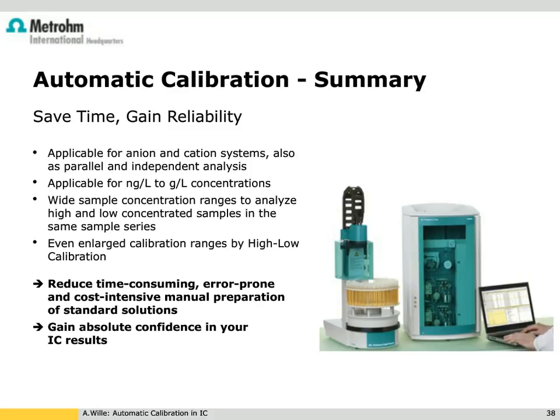Great. And then I've got one from Laura. Can you comment, Liz, on practical suggestions for improving the signal-to-noise ratio? Well, I guess going on from the noisy baseline, the first thing is probably check your instrumentation. So if your pump or your suppressor aren't working efficiently, then that can increase your noise.